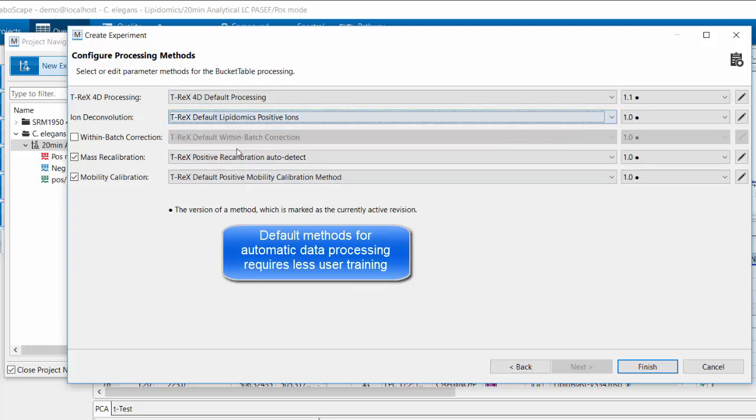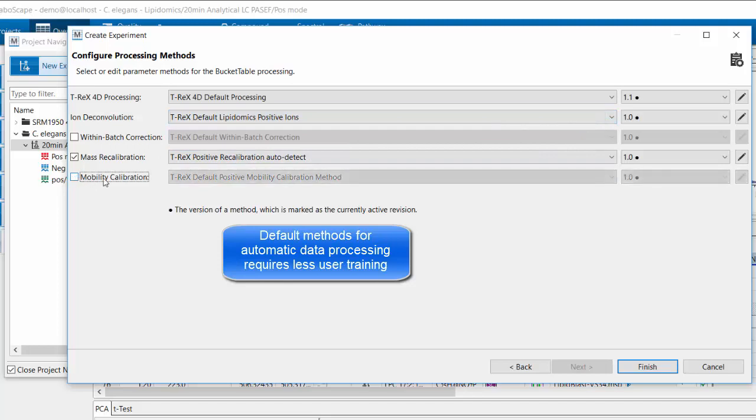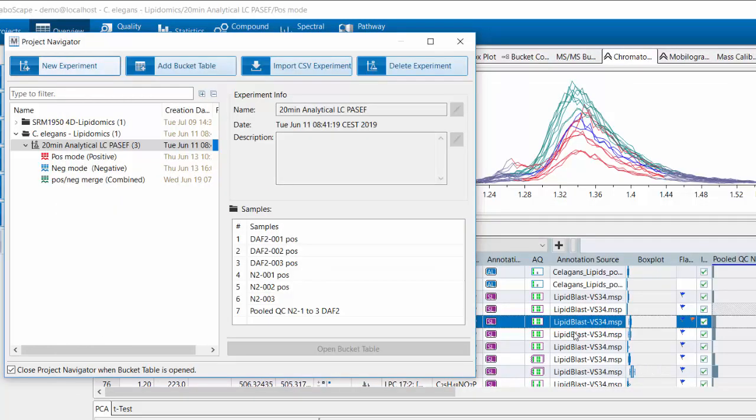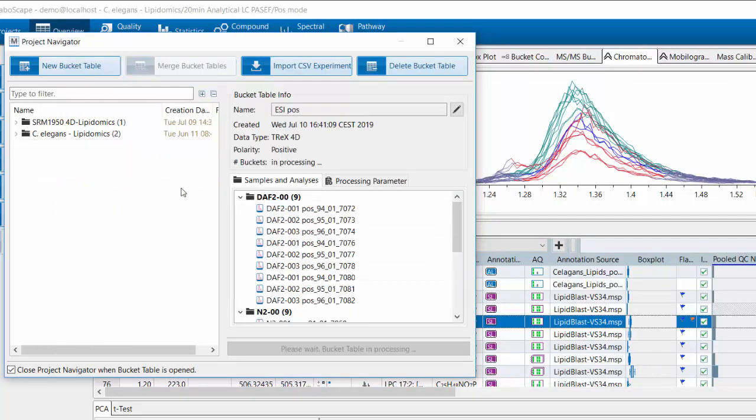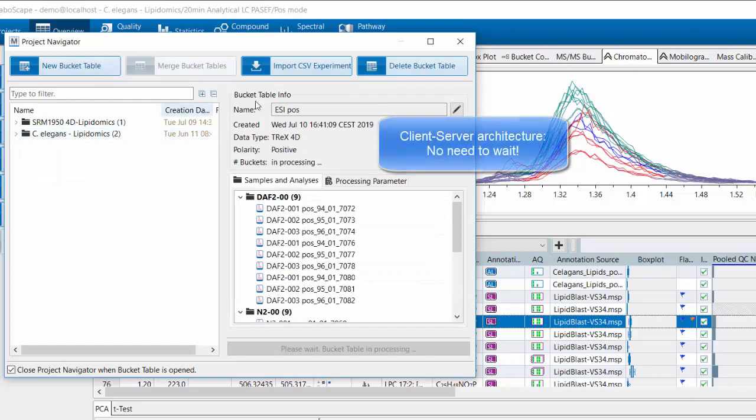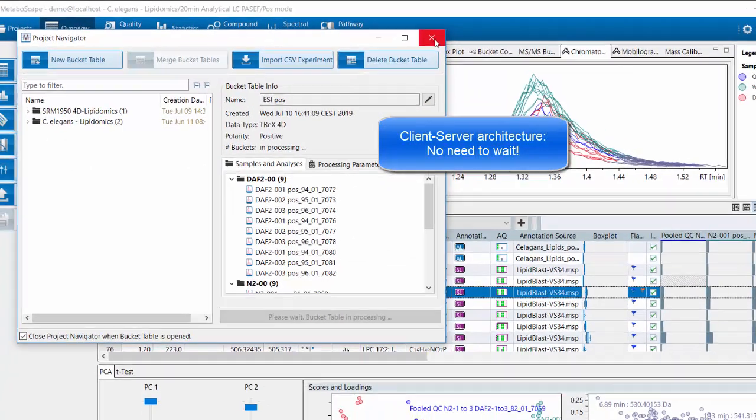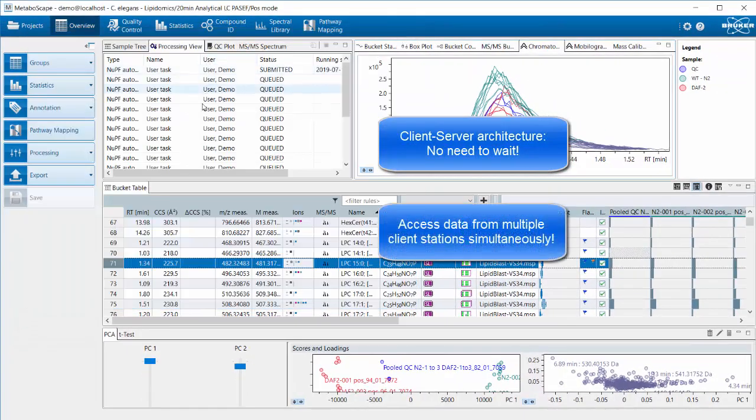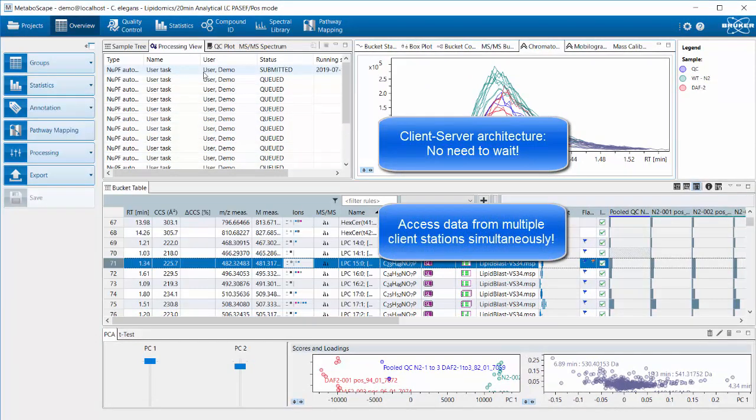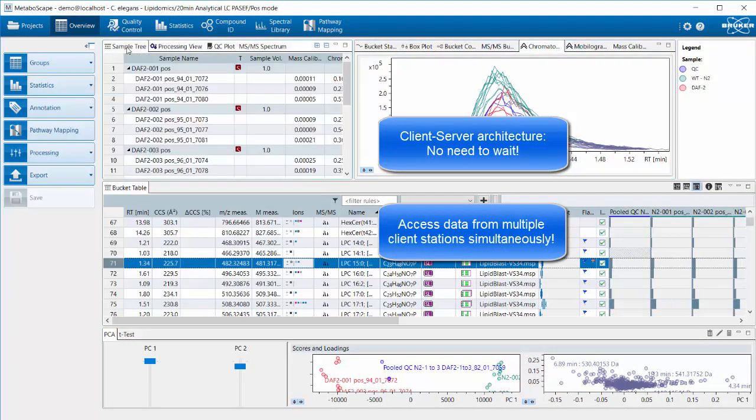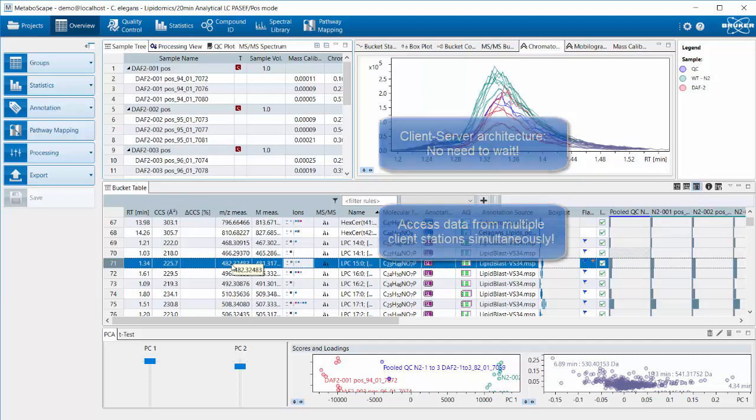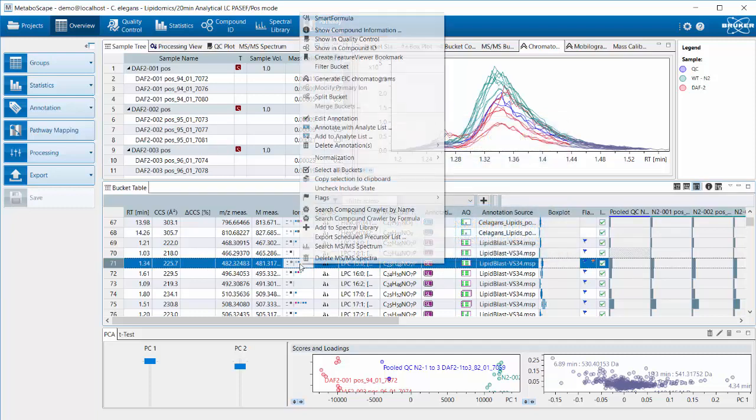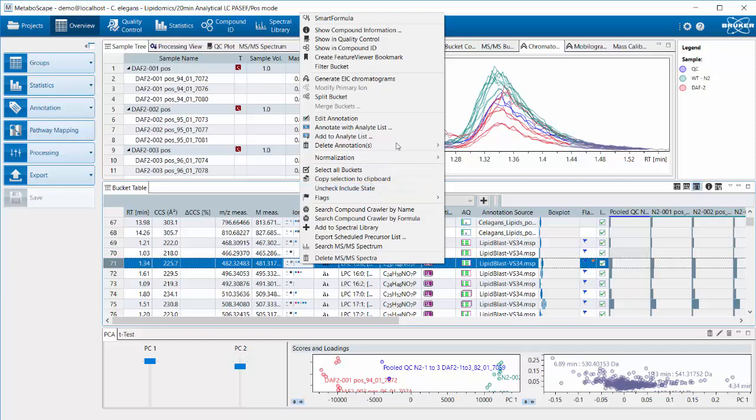The processing methods are pre-configured in Metaboscape. You can just select them. You see here I selected the lipidomics positive ion configuration. I deselected mobility calibration because this was already performed on the instrument. Starting the processing, you see the benefit of client-server architecture. It starts processing in the background, but I can actually work on data that's already processed at the same time while the new data is processed in the background.